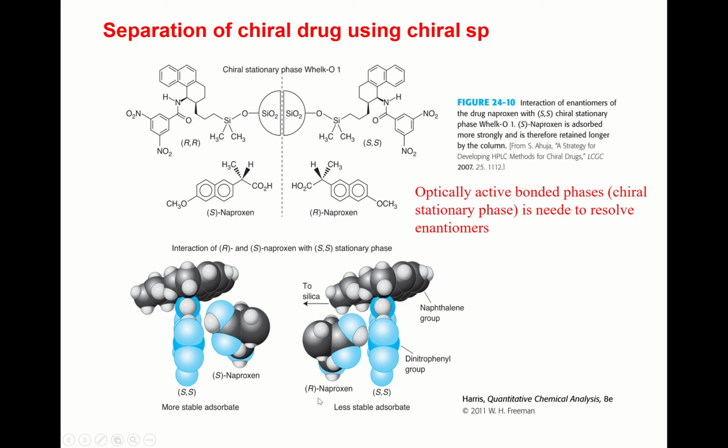R naproxen here has a less stable adsorbate, but S naproxen is strongly adsorbed on this bonded phase. Since the interaction energy between this bonded phase and R naproxen and S naproxen are different, chiral separation is possible.